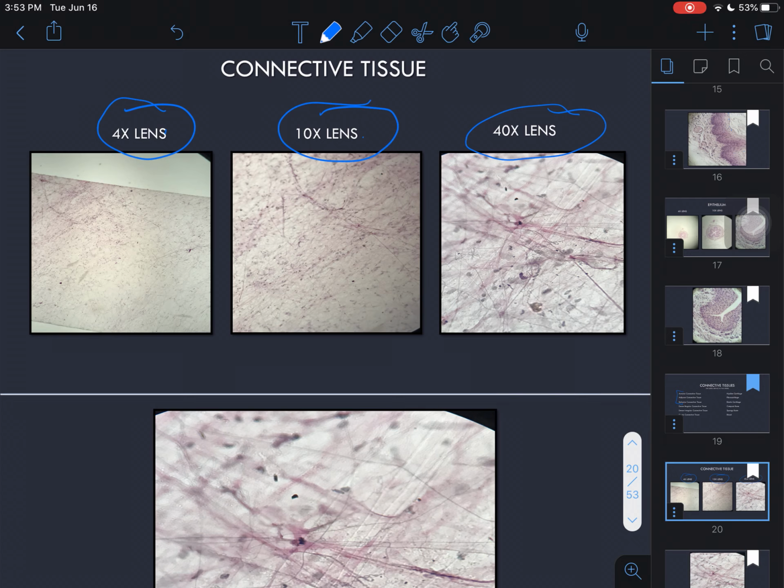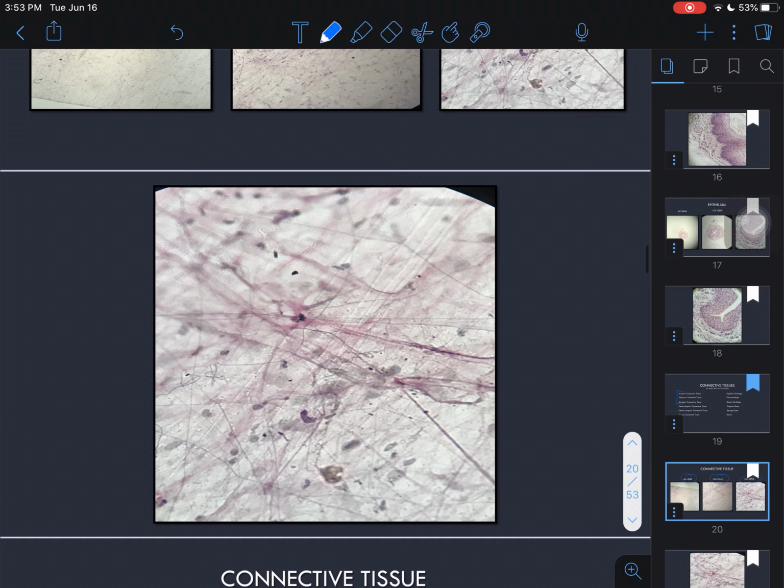So as we get closer, this is one of those few tissues where the only thing you are going to see on the slide itself is the areolar connective tissue. And what this reminds me of, for any of you who are Texas natives, right? In the late fall, when we start getting all those nice blackbirds on the telephone lines, that's what this reminds me of, telephone lines with blackbirds sitting on them everywhere. And since blackbirds spend most of their time in the air, this is areolar connective tissue.